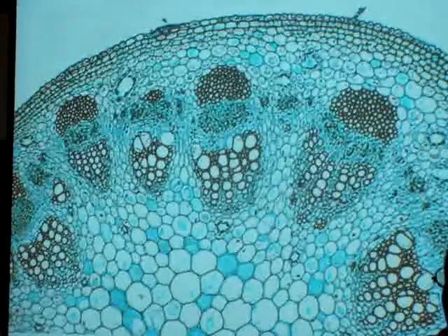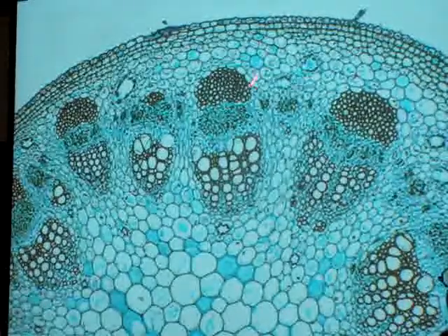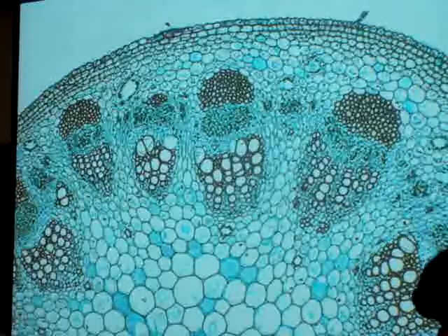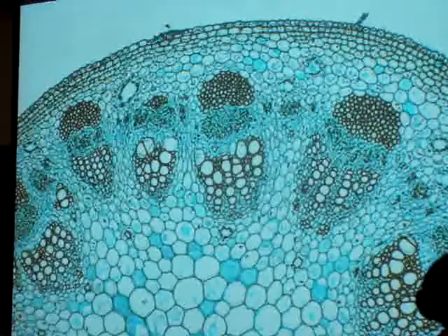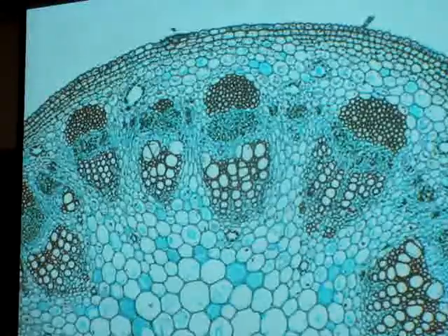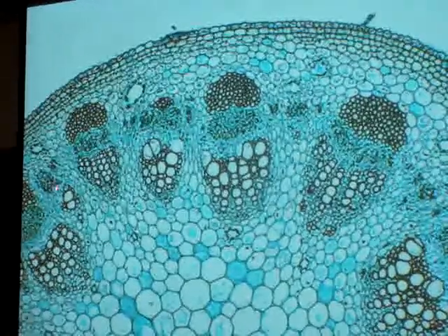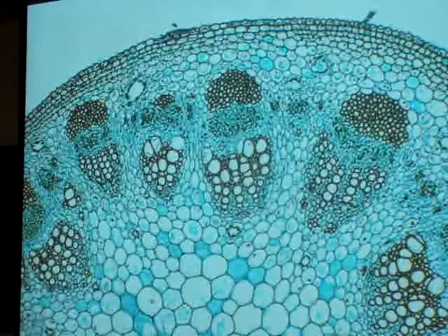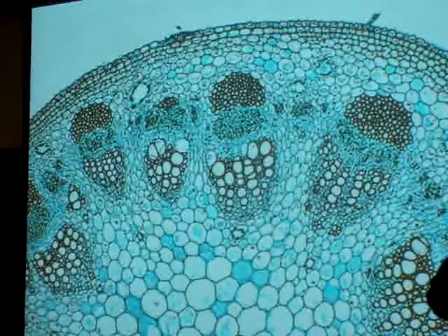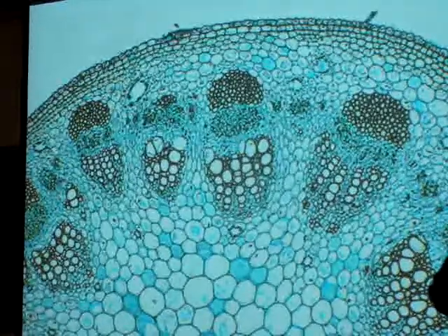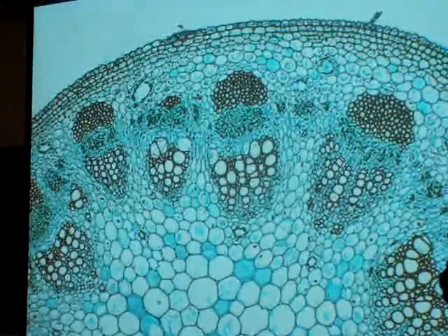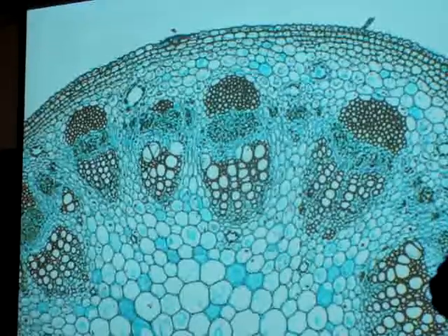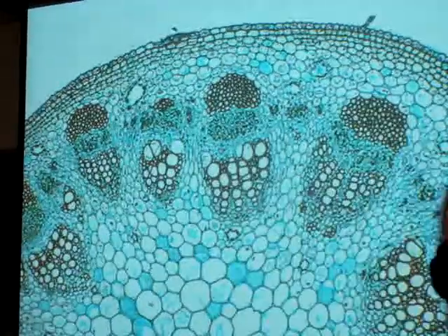And that's not terribly obvious on a lot of these slides. So the things that you're really sticking with are your tissue types. Xylem, phloem, sclerenchyma. Are you going to add the pericycle? I might because it's something to keep track of in the dicot root because that's where you can really see it. It's this line. In the stem, I guess I should say no. I'm not going to. Pericycle, no. Let's just stick with tissues. It's more important in roots. That's where your lateral root emerges from.